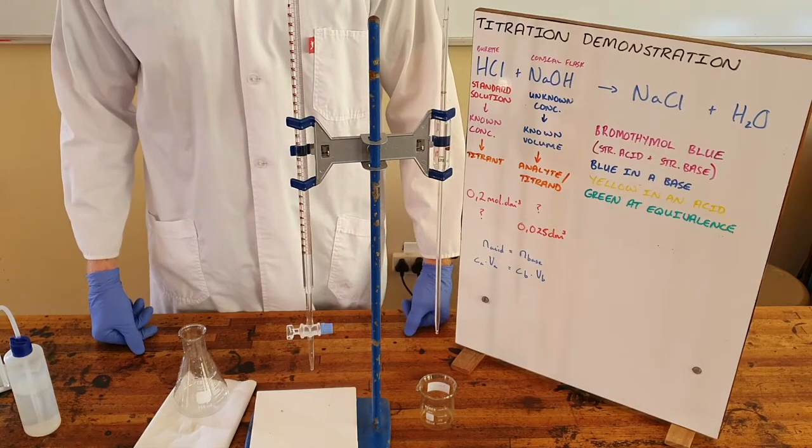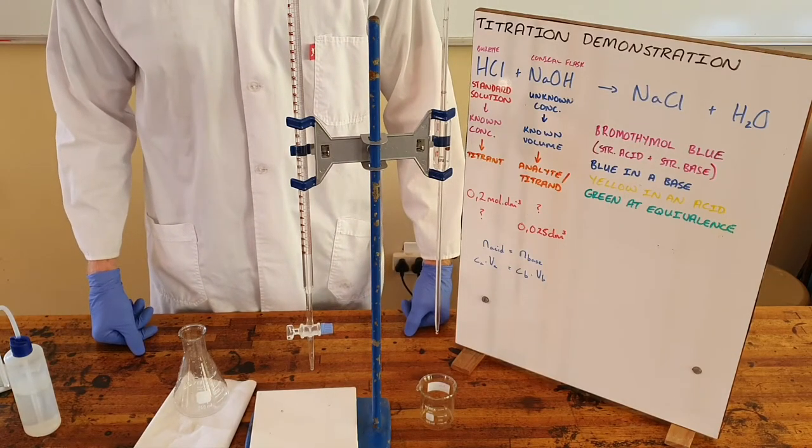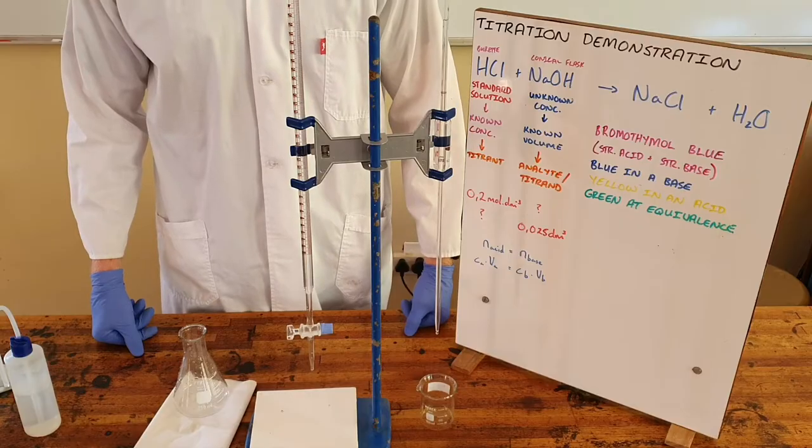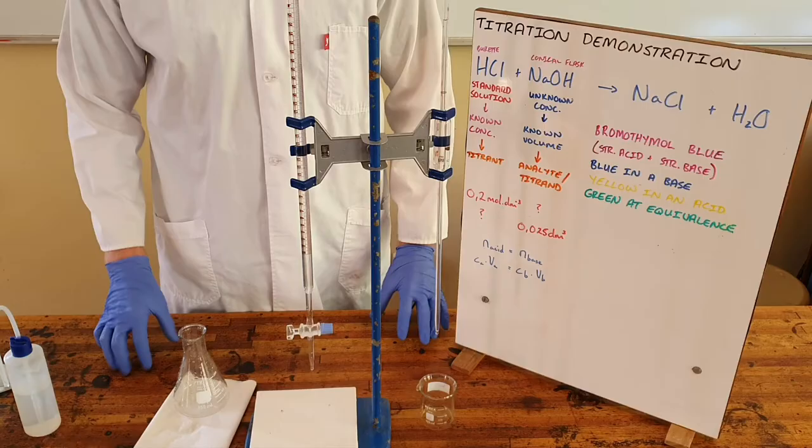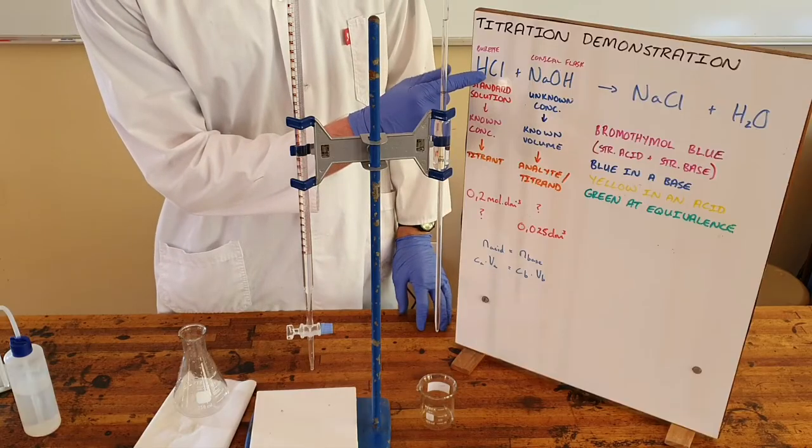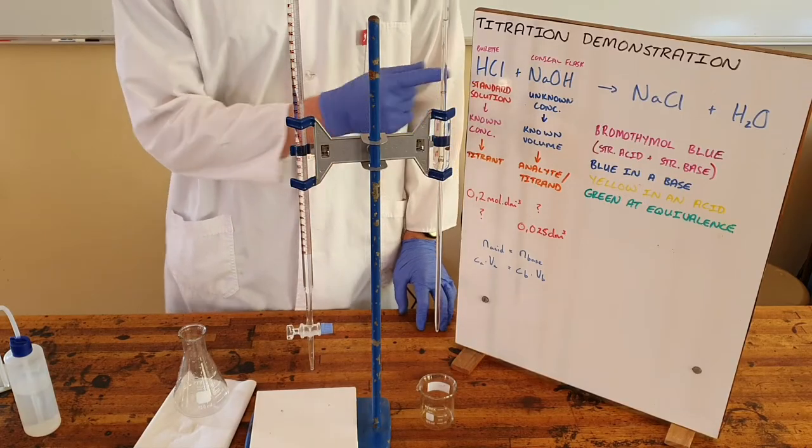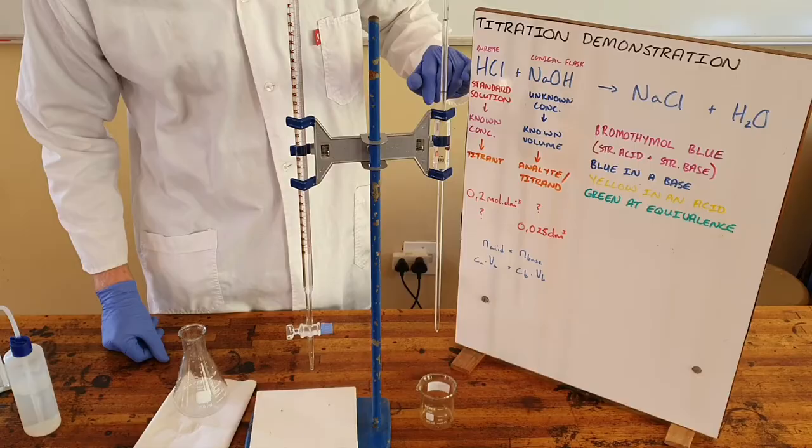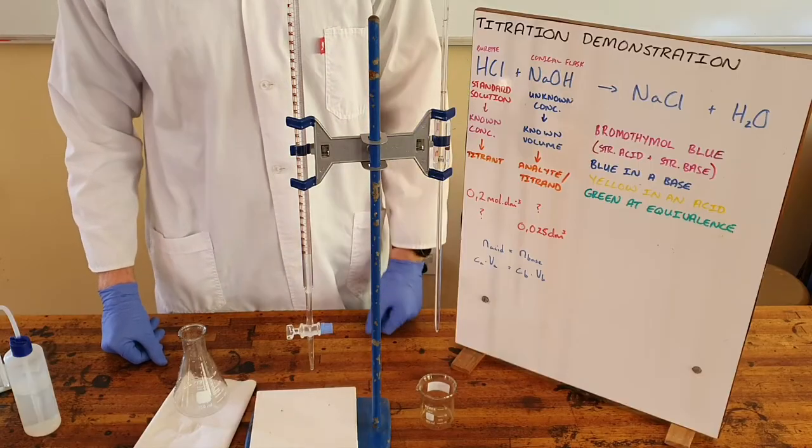We know that titration is a lab technique that is used to determine the concentration of an unknown substance. The example we are going to be doing today is where we are titrating sodium hydroxide with hydrochloric acid. The hydrochloric acid here is our standard solution.